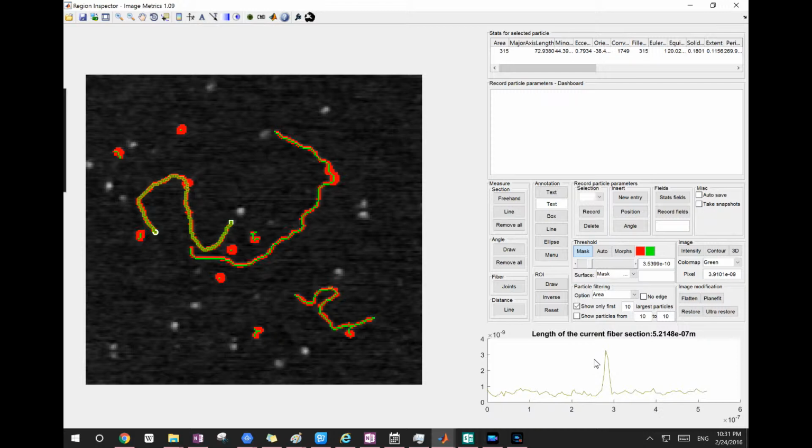The direction of the trace is determined by the end point of the DNA's trace on the image. The block represents the starting point of the profile, which means this point at the beginning, the 0 point, is where the block is. And the end of the trace, the circle, represents the end point of the profile.